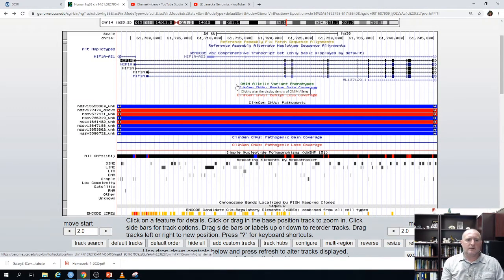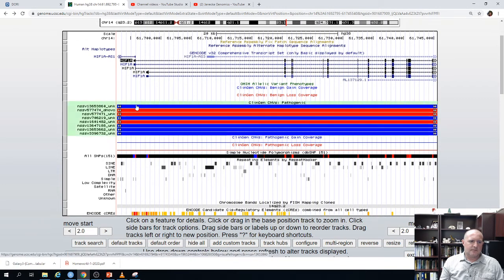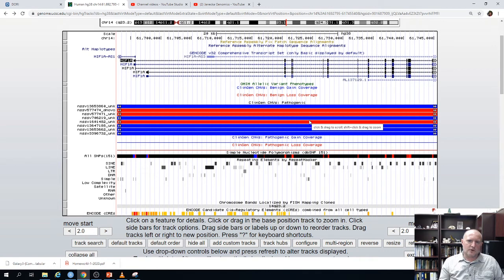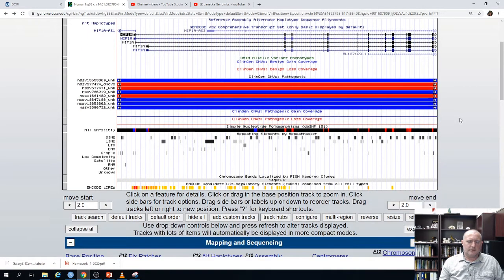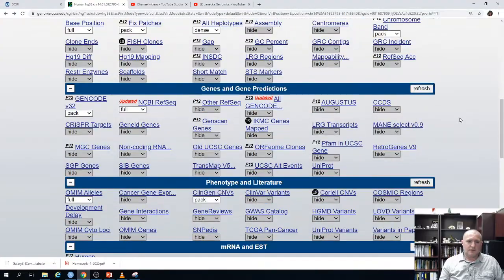The OMIM clinical variants are variants that have some sort of disease phenotype. The clinical CNVs are basically either duplications or deletions of large regions of a chromosome that also have some sort of pathogenetic disease phenotype. If we look at them more closely, we can see where they're located and what part of the gene they're in — giving us more information on what could be causing that particular disease phenotype.